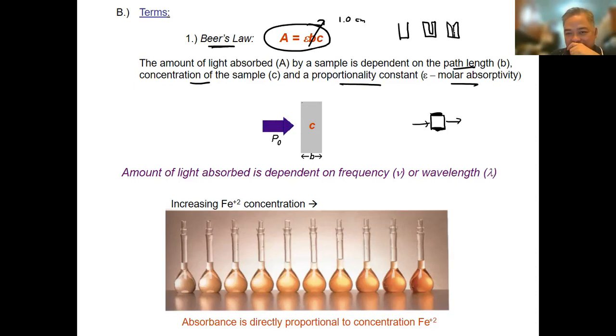Now, even though you say this is not 1 centimeter, the way that you look at it, you face it, you press it, and that is where the light enters. But you can have more than 1 centimeter. It's just typical that 1 centimeter is the length.